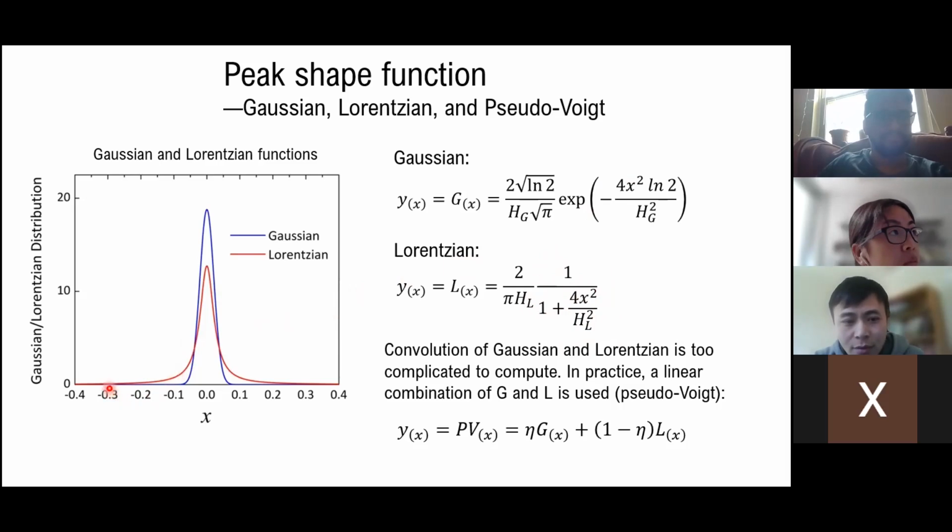The peaks start rising early on, then gradually increase to a point that is not very high in terms of absolute intensity, then gradually decrease. Those are the graphical features of a Gaussian and a Lorentzian. As I mentioned, a very simple way to simulate the practical peaks is to construct a combination of them.